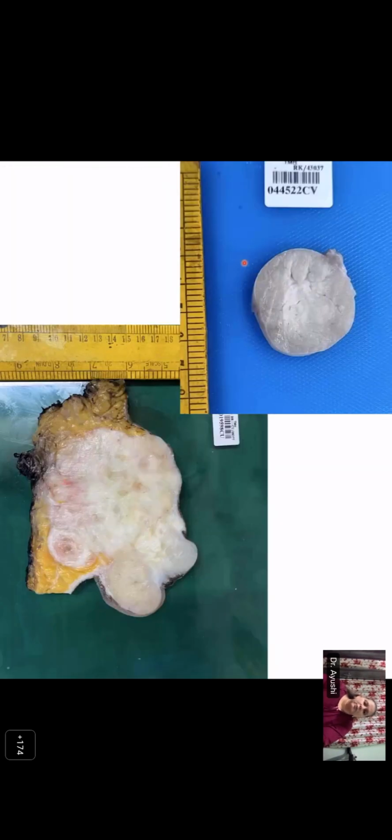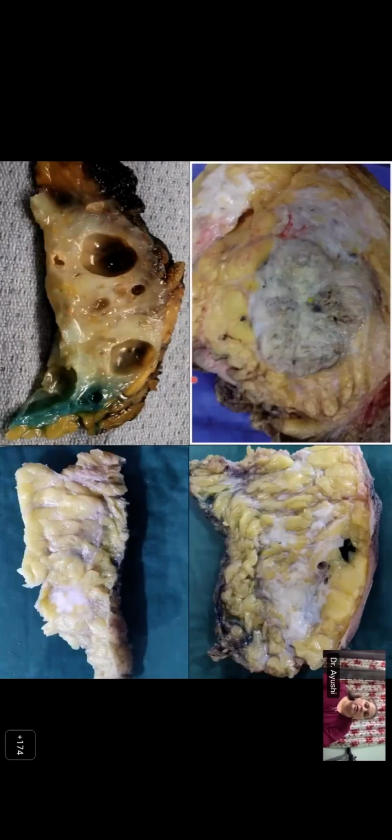And if it is an encapsulated lesion with slit-like spaces, this is of course a fibroadenoma. While if you have a tumor which may be well circumscribed but unencapsulated with pushing margins and a very fleshy appearance, it is more likely to be a sarcoma, likely Phyllodes. This is what an invasive carcinoma would look like, a heterogeneous lesion with ill-defined margins and presence of necrosis. Fibrocystic disease has a cystic appearance and a little bit of homogeneous appearance. However, in some instances, fibrocystic disease can also appear very irregular and appear like infiltrating.